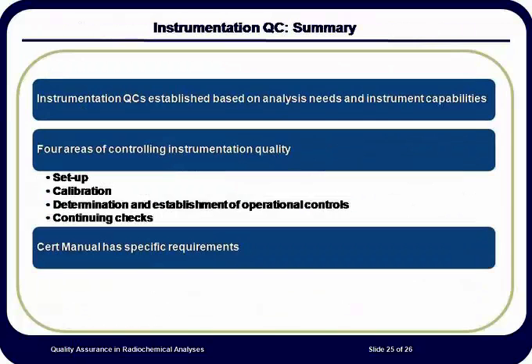Environmental conditions in the laboratory, such as vibration and light exposure, may potentially affect the QC measurements and should be taken into consideration when evaluating QC data. The instrument should be checked on a routine basis for all parameters that feed into the final analytical values. The certification manual contains guidance on the minimum checks that should be performed on each instrument.